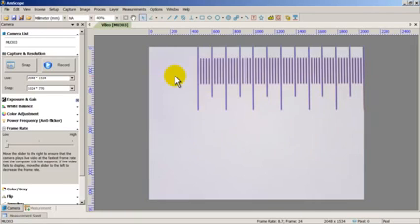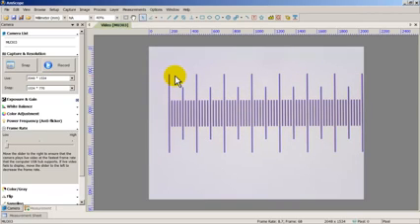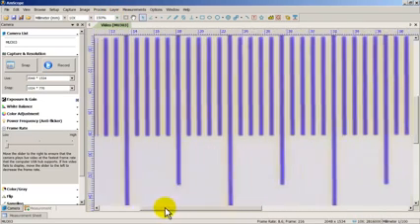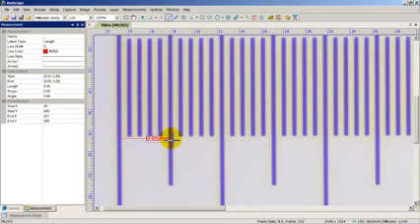there you have it. There's the micrometer stage, and let's just go ahead and make sure that the measurement I just made is correct. So again here, it says NA. You're going to change that to the objective that you just worked with, or the current objective you have set on the microscope. And I'm going to go ahead, let's go 150 this time. Okay. And I'm just going to go ahead and choose the line option on top here, underneath the menu bar, just like before. And I'm going to measure this point to this point. And there you go, 0.05.